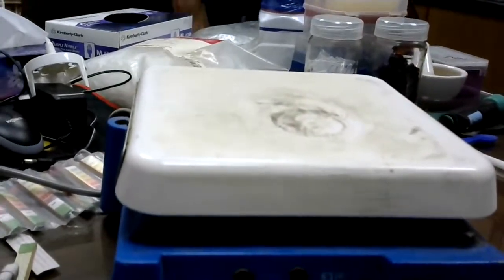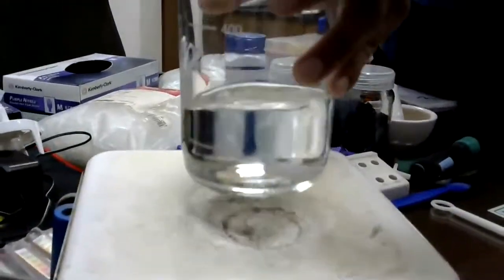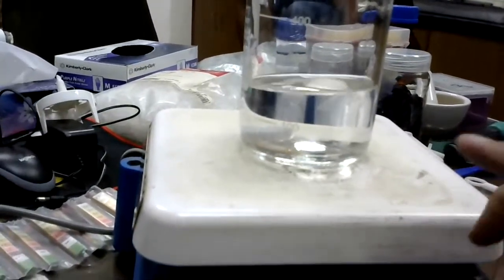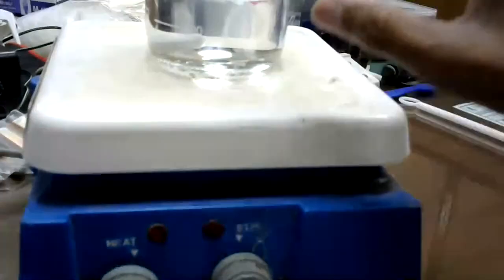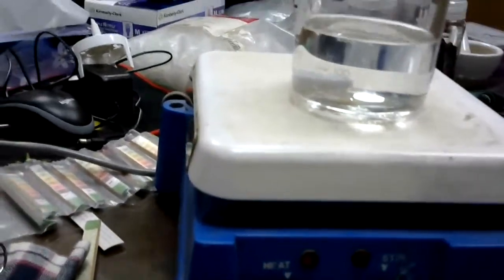And if you don't want to heat, don't switch the heater on. If you want to heat, then put the heater on, or if you want to stir without heating, don't switch on the heater, simply do the stirring. So, hot plate with stirrer.